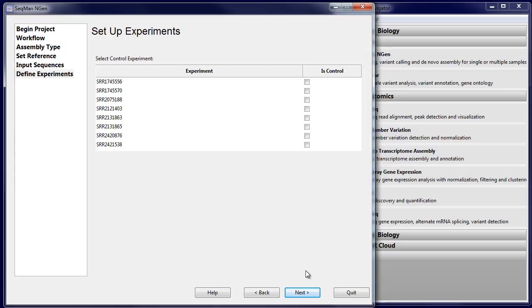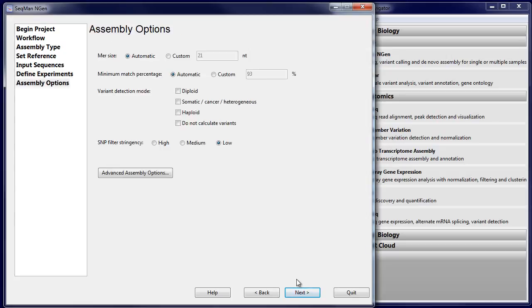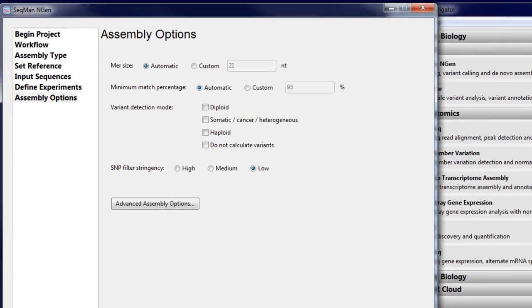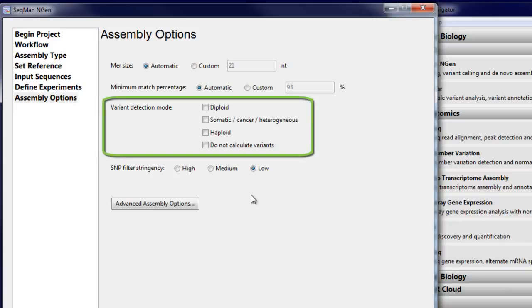Optionally, you can specify a control genome if you have one. On the Assembly Options page, select the Variant Detection mode you wish to use. In this case, we want Haploid.